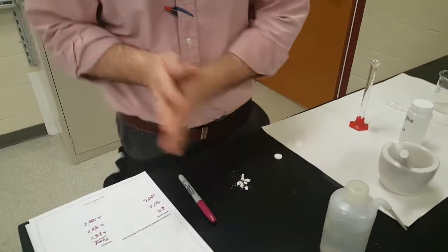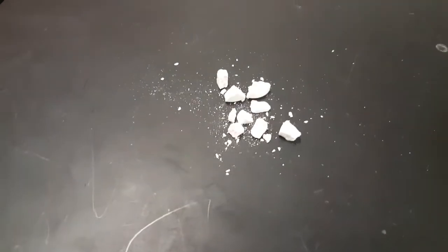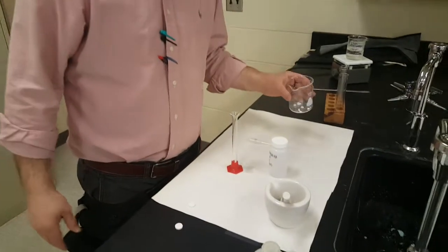And personally, guys, just so you know, when you do this, can we do it right over the beaker so we don't lose it? See all that extra? Yep. I want it all. I want to get as much of it in the beaker as you can. So in my case, I would break it up right over the beaker. That'll work too. That's what Monaco did, but it's a little sloppy.